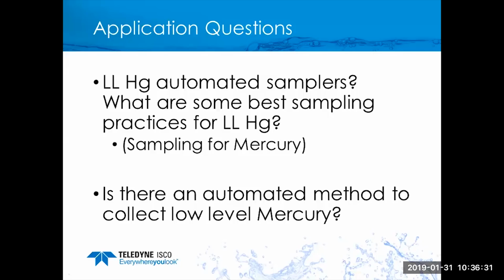And the purpose for that is if you're testing for metals, why would you want to risk falsely elevating the presence of metals because you have sample in contact with metal? The second point that you'd want to avoid is the use of any glass bottles. And while not all glass bottles have lead content, i.e. metal, why risk it? So you would want to use plastic bottles. Do not use glass bottles because there is at least the potential for presence of metal.